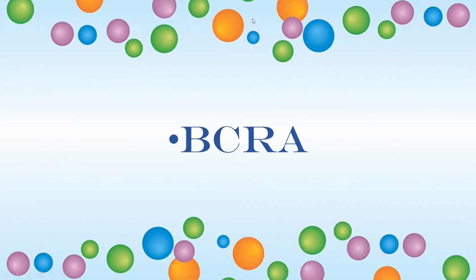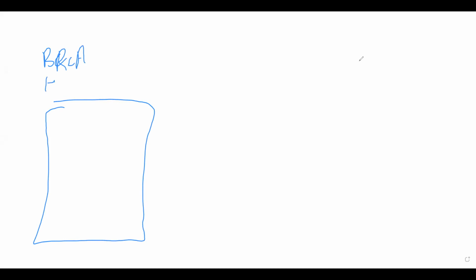Now I will be demonstrating how we draw the NPA and northern blotting. So I will be starting with NPA. First, let's draw it all in here. I will be comparing two things: the BRCA bonded to a histone, as I said, which is not degraded, and the degraded BRCA. So I'll put here a BRCA with histone, and here the degraded BRCA.